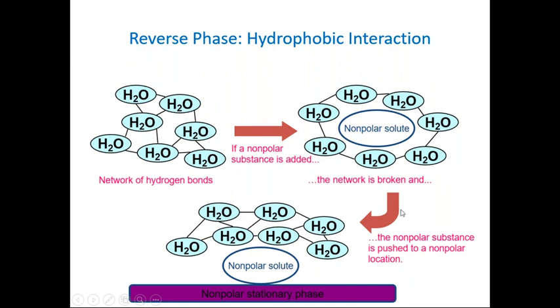The nonpolar substance is pushed to the nonpolar location because of the nonpolar interaction, and the polar analytes of this will be soluble in the water and will elute.